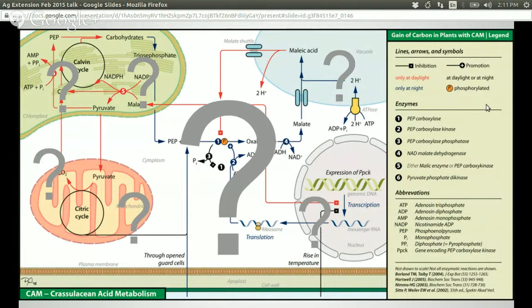So I'll give you an example. Right now, there's ways of estimating photosynthesis rates from satellites. But this measurement's never really been confirmed with actual ground measurements. So one big question we could try to ask is to ground truth these global photosynthesis measurements from satellites to see if they're actually accurate or not.